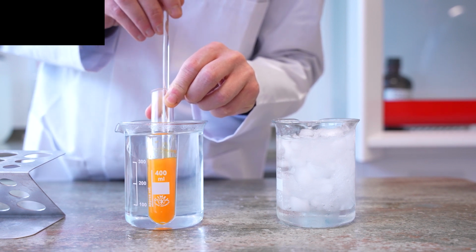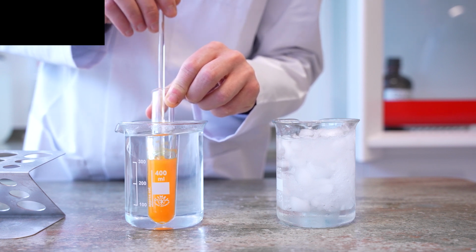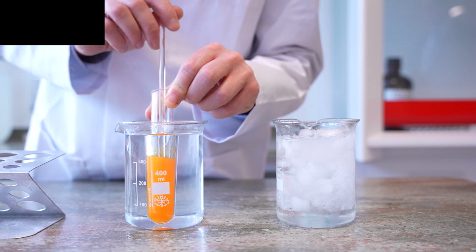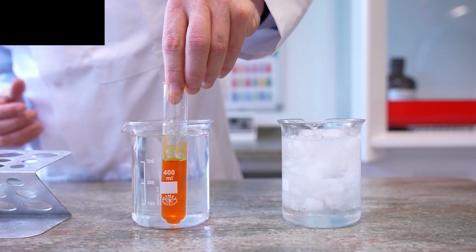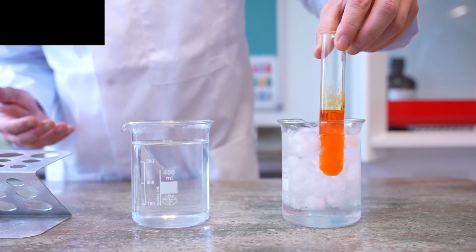As we stir it, what should happen is the product will dissolve last, because it doesn't dissolve very well in the solvent, but the impurities will dissolve really, really quickly. And now you can see that that's fully dissolved because of this hot solvent. All we have to do now is put it straight into the ice bath.